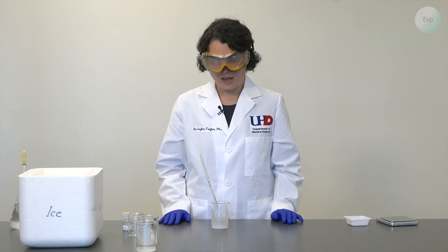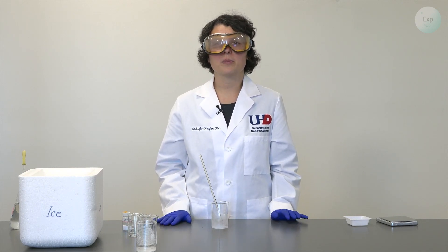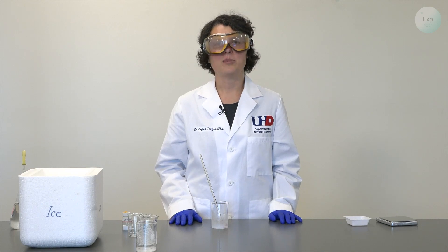For about a minute and a half, it has been reading 21.0 degrees Fahrenheit. This is a good cue for me to end the experiment and move on to my second beaker, to which I will add the ice and monitor the associated temperature changes.